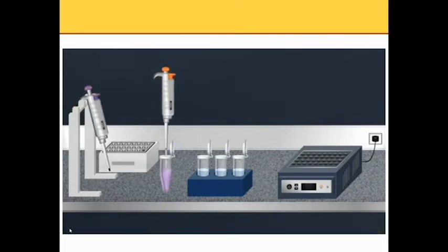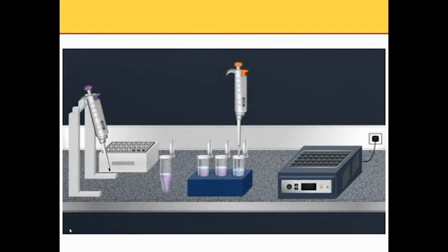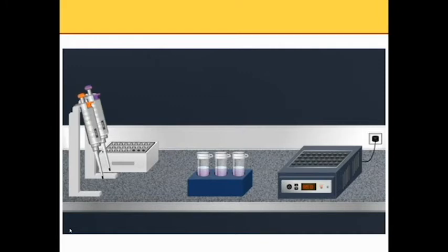Samples may be biologically derived, for example, from prokaryotic or eukaryotic cells, tissues, viruses, environmental samples, and purified proteins. When the sample buffer has been added, the samples are then heated at 95 degrees Celsius for 5 minutes.